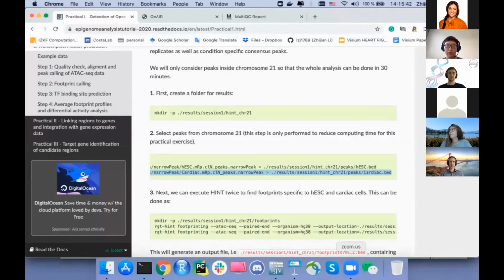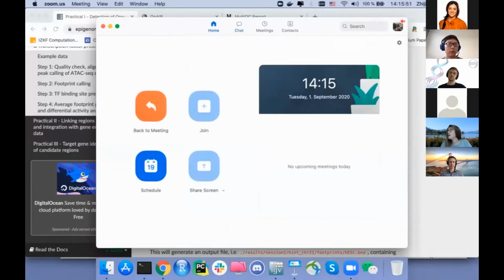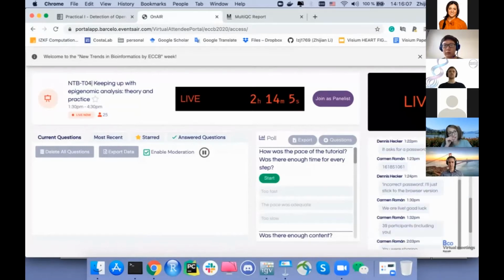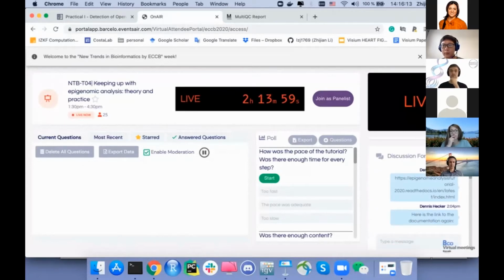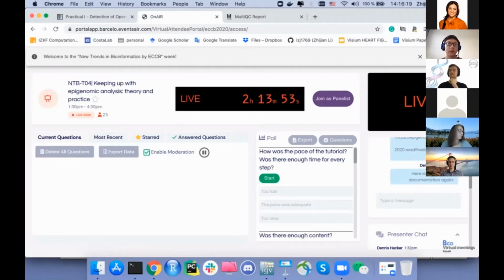Okay, so is everyone able to run these commands? If you have a problem, just let me know.